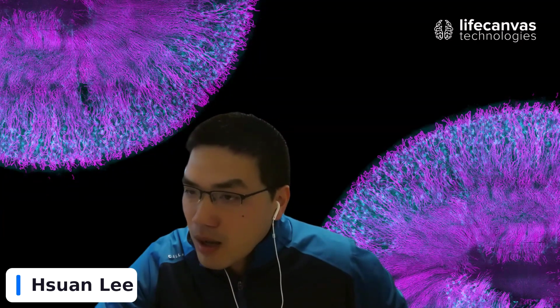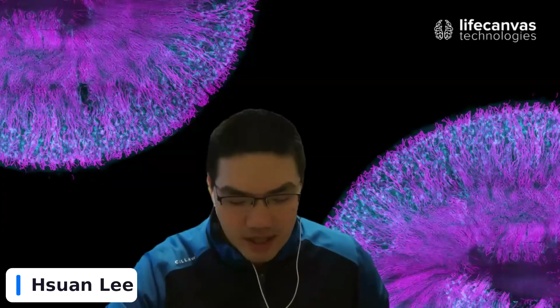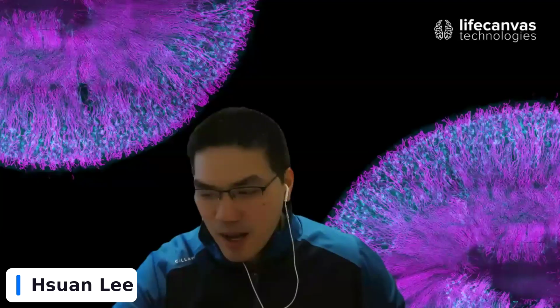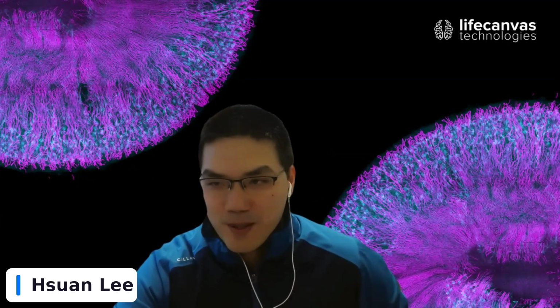So I saw Michael Weber sending a message to us asking which 785 dyes we have used. The one that we used that was kind of working in the 785 channel was called MB800Z. And we also contacted the author of the paper, and he also mentioned that that might be the best dye for that channel for now. But hopefully in the future there will be a much better dye chemistry.